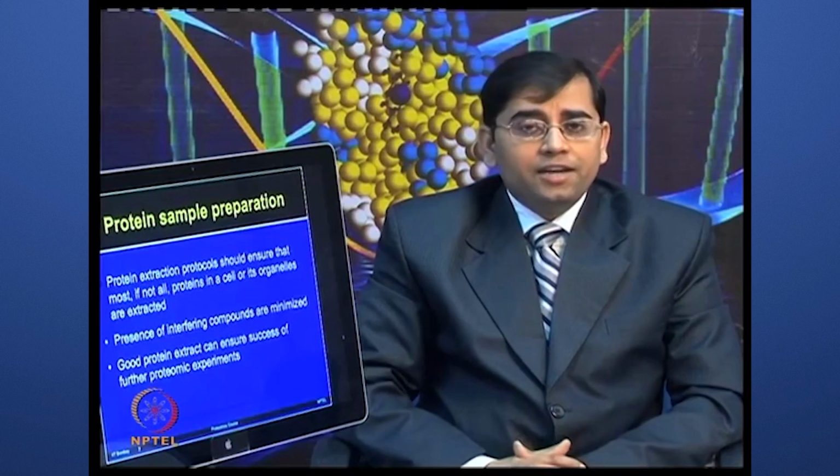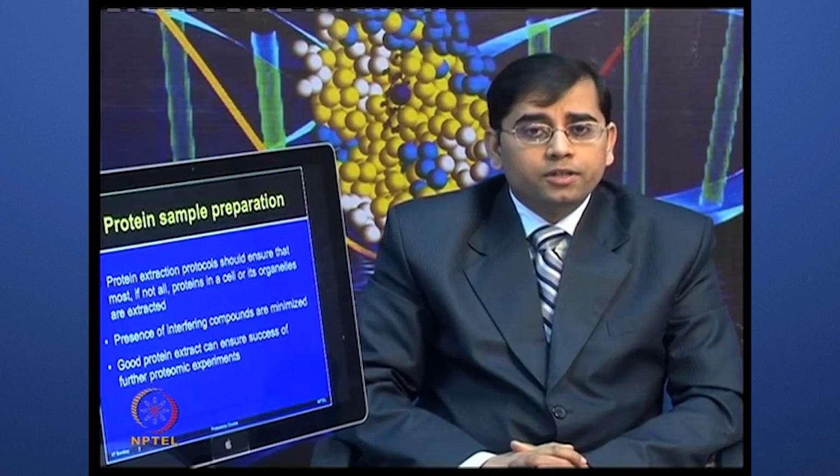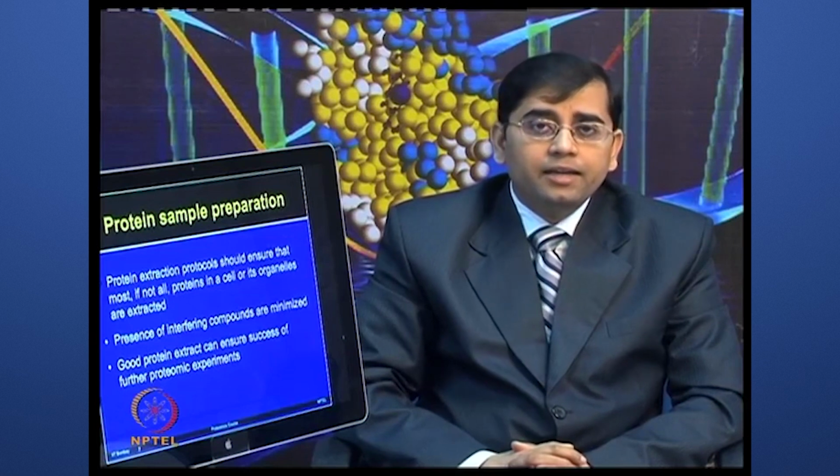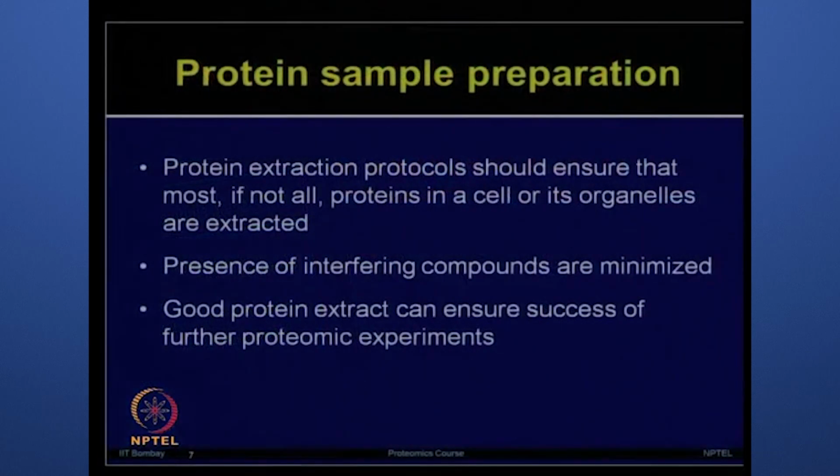Now, protein extraction protocols need to ensure that most, if not all, the proteins in a cell or its organelle are extracted. The presence of interfering compounds should be minimized. So, if you have optimized a very good protein extraction procedure, that should ensure that you have a very wide proteome coverage, and that is ultimately going to determine the success of your proteomic experiment.